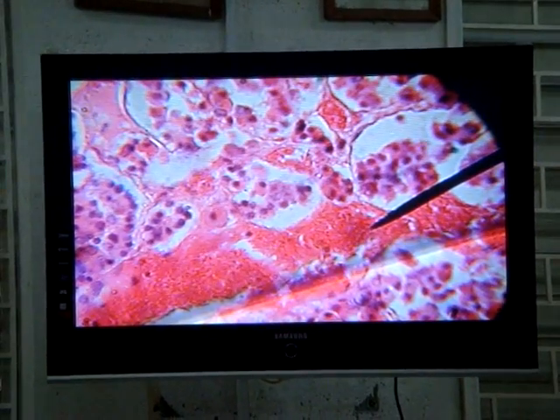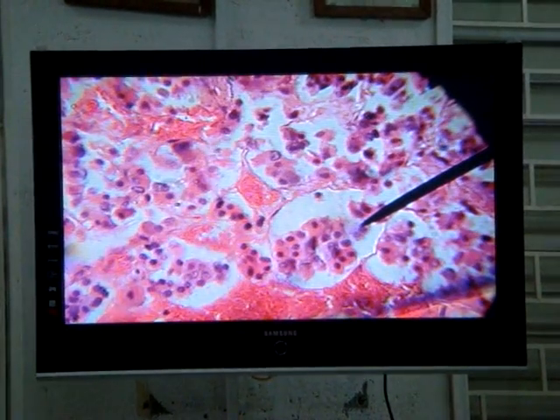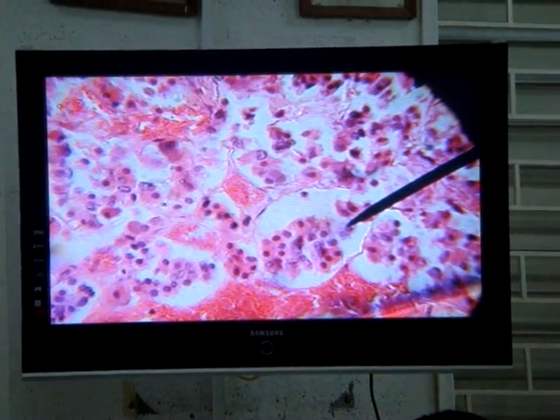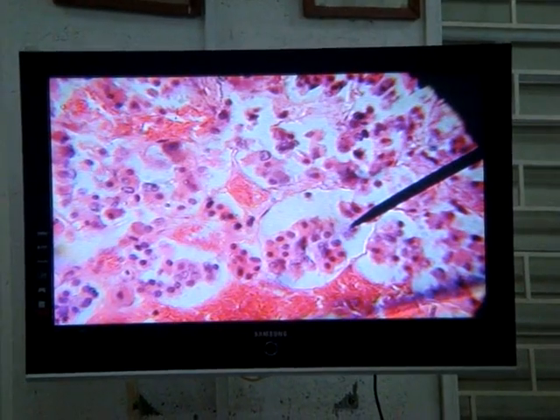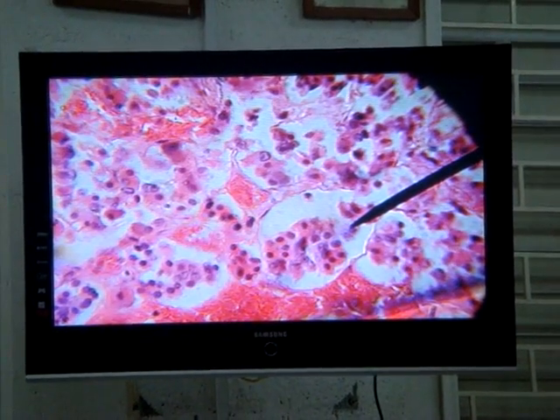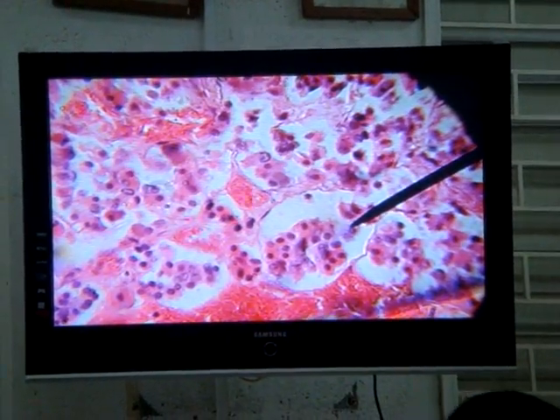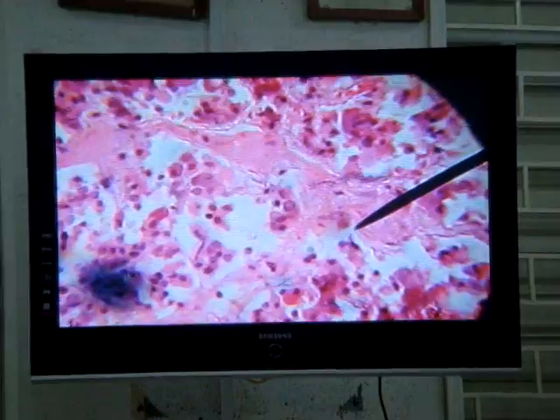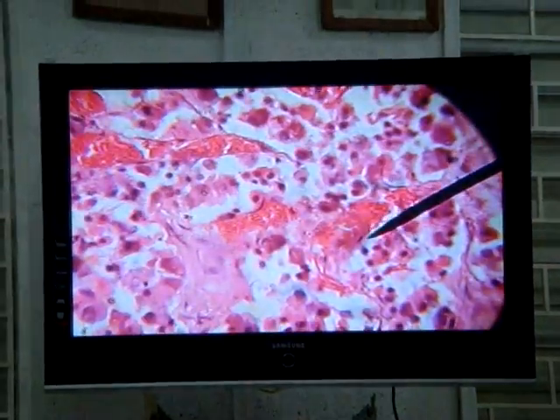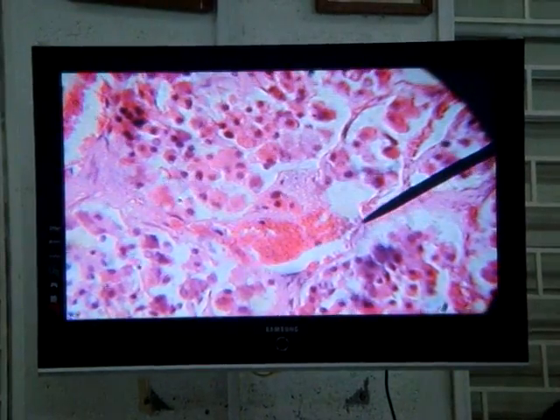Now let us take a more detailed view of these cells, these cords of cells. I want you to observe that the cords have some beautifully colored cells. Some cells have brilliant pink cytoplasm, whereas in others the cytoplasm is not so brilliant. And it seems as if there is a third group where there doesn't seem to be much cytoplasm at all. So we have to tell you that in the anterior lobe there are three kinds of cells. Let me navigate my way through so I can find some beside each other.